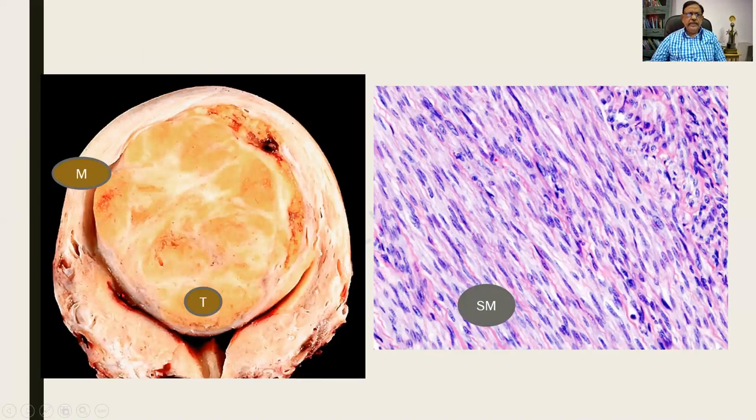Again, a tumor, something like this can be kept for your exam. This is a specimen of a uterus and it measures so many centimeters. The cut surface shows a large tumor projecting into the endometrial cavity. It measures so many centimeters long. It has multiple trabeculae. The color is somewhat pinkish brown or grayish white, the trabeculae. And this is a normal wall or the myometrium. It is compressed and it measures so many centimeters in thickness. Microscopically, we see the bundles of spindle-shaped cells and this is the cut surface of the same. Sometimes you find that they will be turning on themselves, which is called a whorled pattern.